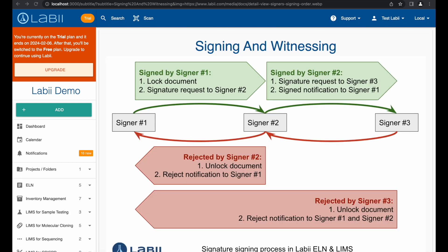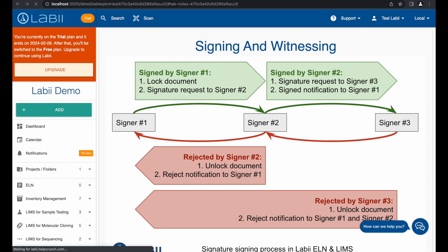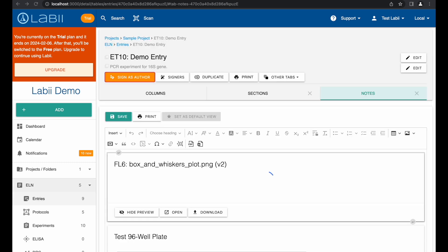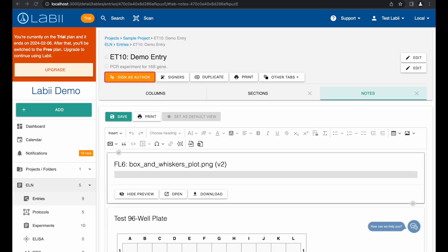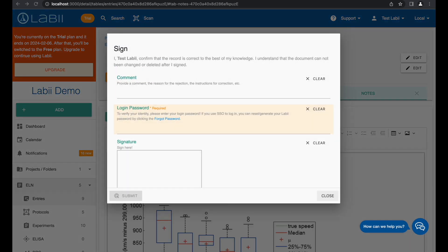Labii enables you to sign and witness experiment records within an electronic lab notebook to meet FDA 21 CFR Part 11 requirements. Click Sign as Author button or Signers button. In the pop-out window, provide the comment, login password, and draw your signature.